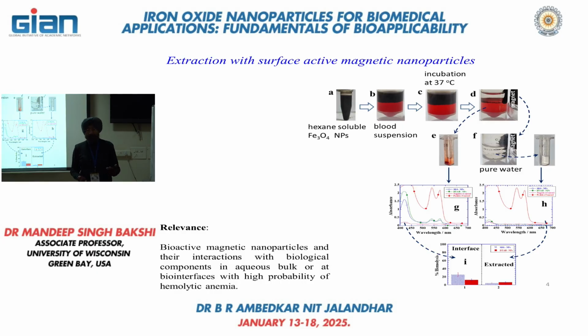They actually break the cell membrane, and hence in this case, when we take the sample from this part of the solution, we have a small absorbance. This one is a control. This one is a small absorbance.